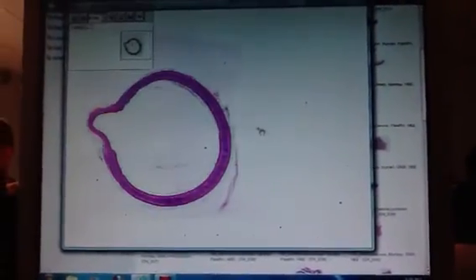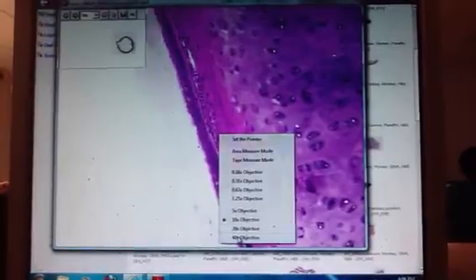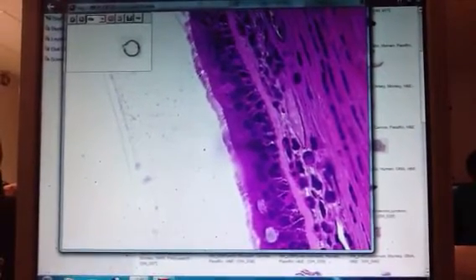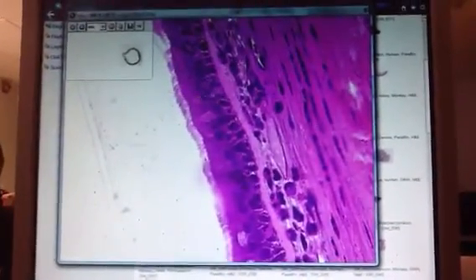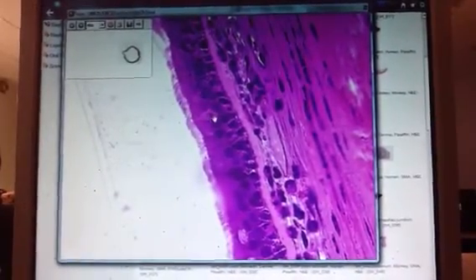This slide should become one of the easiest ones to identify, because when we come into the lumen and you see this very prominent basement membrane, and you can see individual hair-like structures, you know these are cilia, and really the only place you see cilia for your purposes is part of the pseudostratified ciliated columnar epithelium.